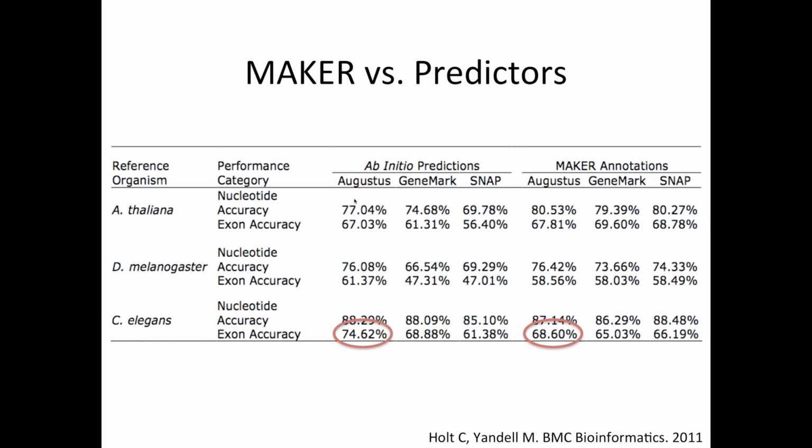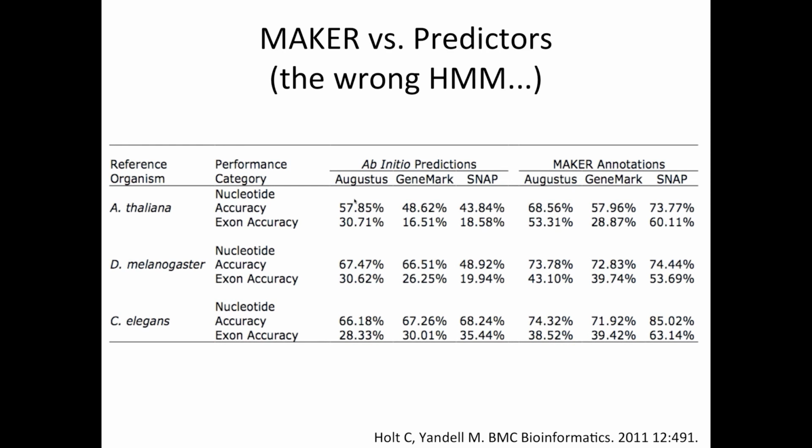And so it's fairly well known in the annotation community that if you train an ab initio gene predictor well enough, then you will do an incredibly good job with the ab initio gene predictor at recapitulating those annotations. But it's really not so ab initio anymore when you've had to have perhaps tens of thousands of gold standard genes to train on. And in so many cases these days, the new genomes that are coming online are in lonely, isolated parts of the phylogenetic tree. And if you try to run ab initio gene predictors on those genomes, they can do fairly poorly.